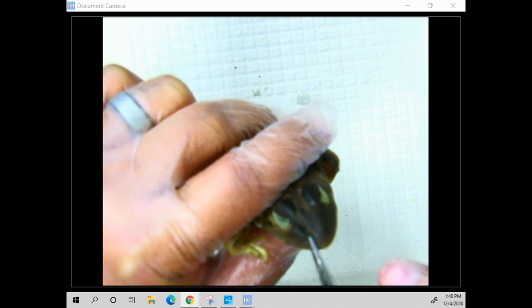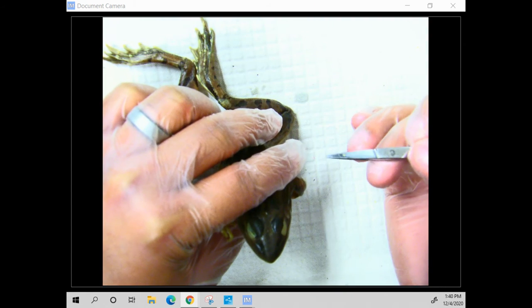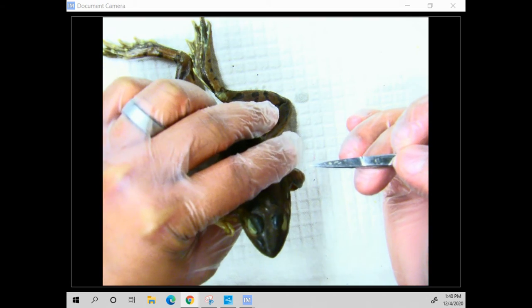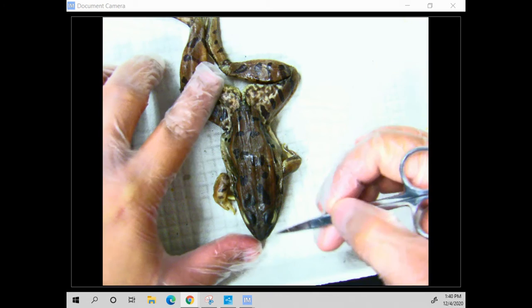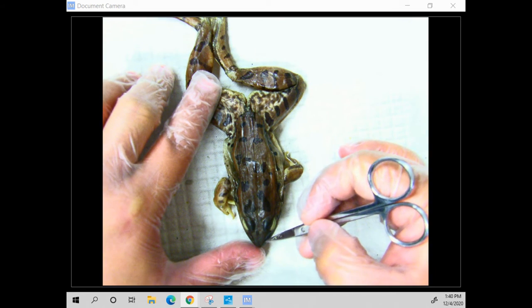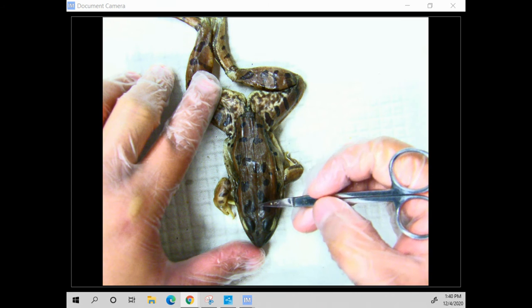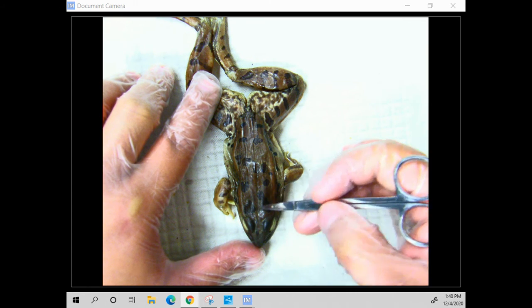There we go, a little bit right there. That is the nose, the nostrils where they're able to breathe in their air. The nose is able to breathe in, getting the sense of smell. So with this, it would be attached to, again, what system transferring information from smell to the brain?